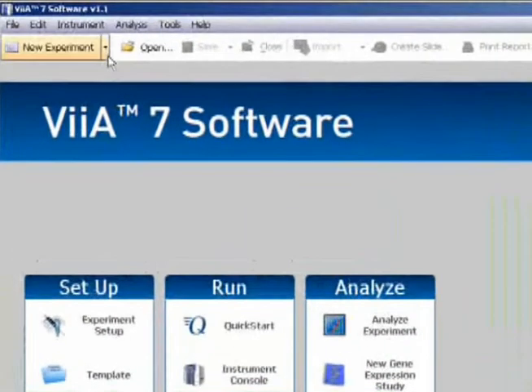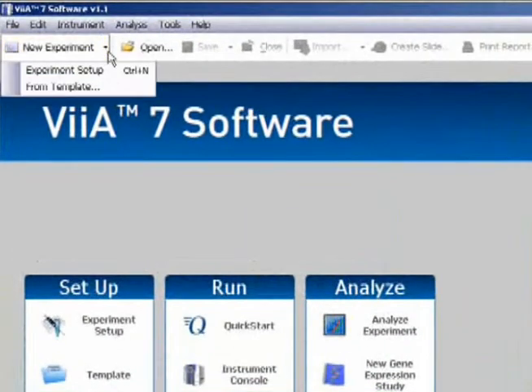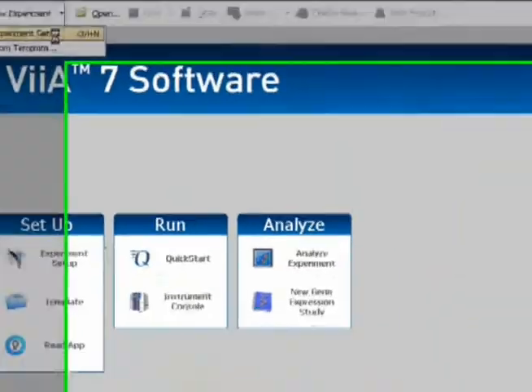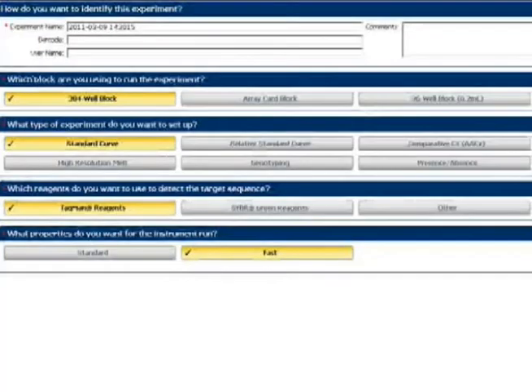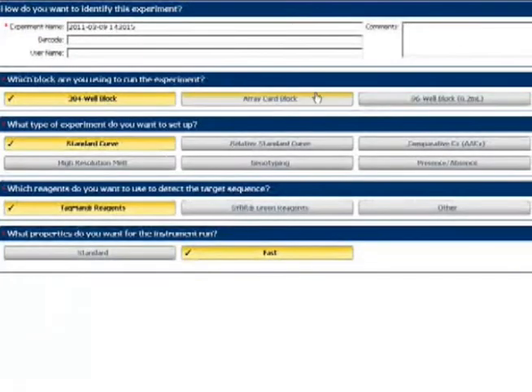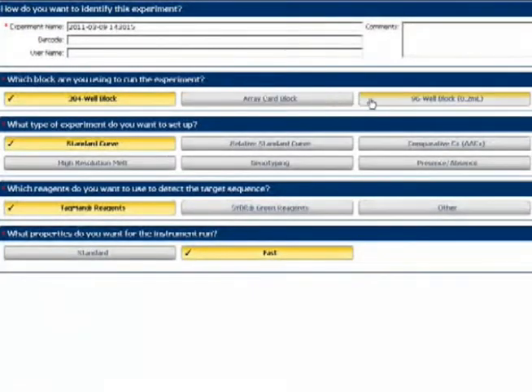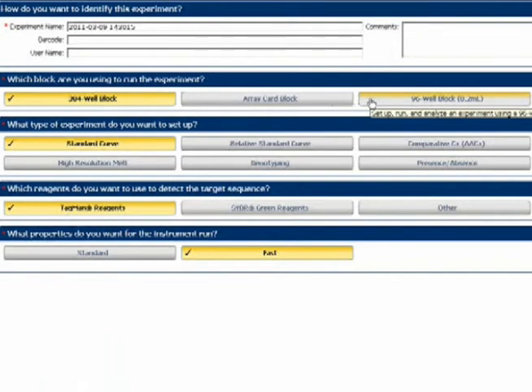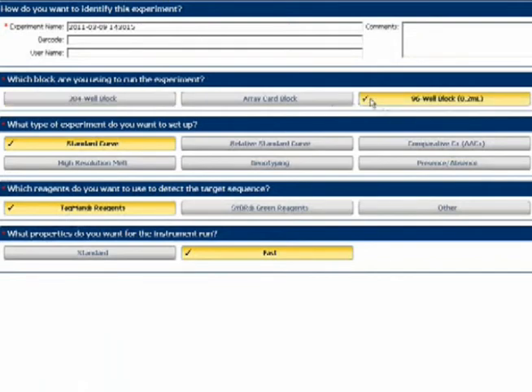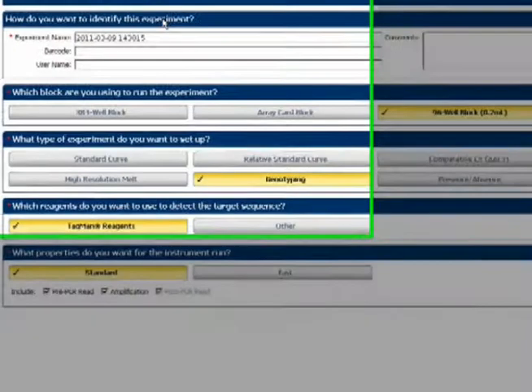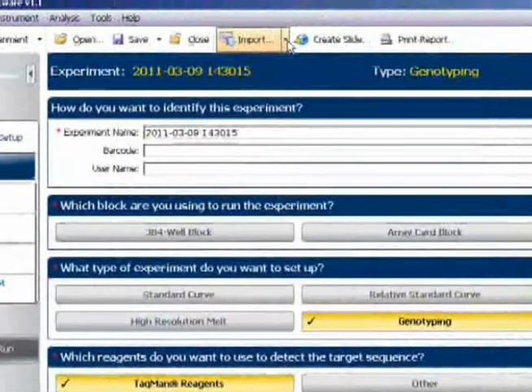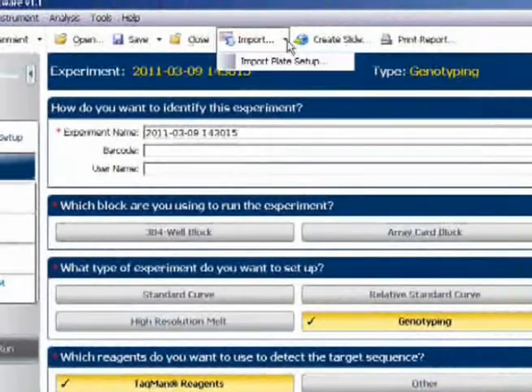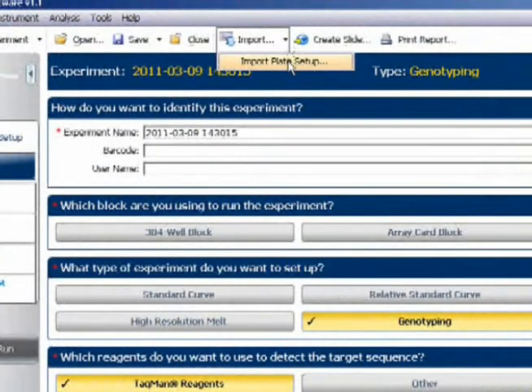I now go back to the VS7 software, click on New Experiment, and choose the correct block size. We'll just say 96 well standard in this case. And the correct run type, genotyping.